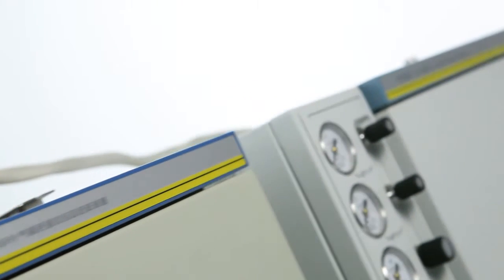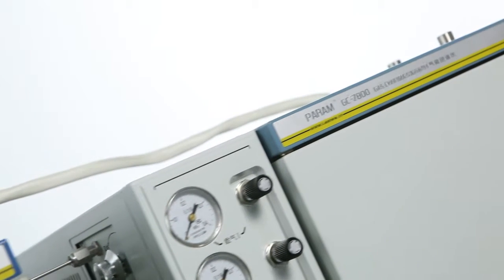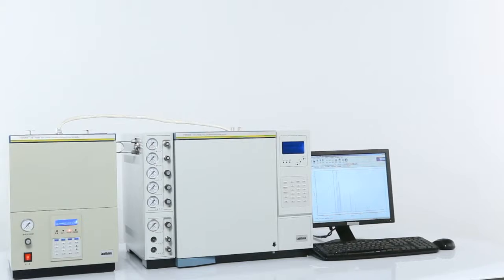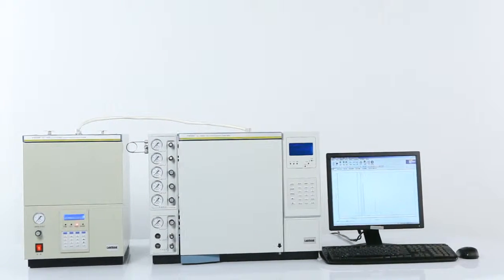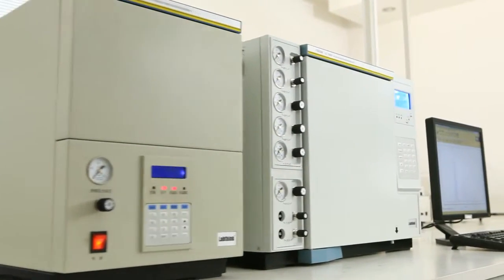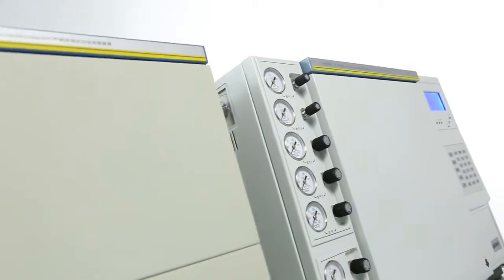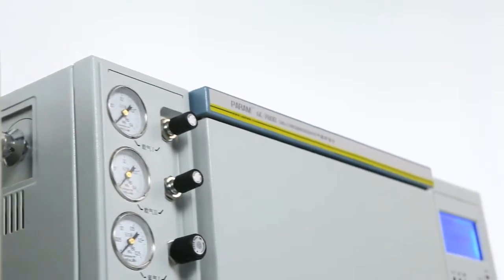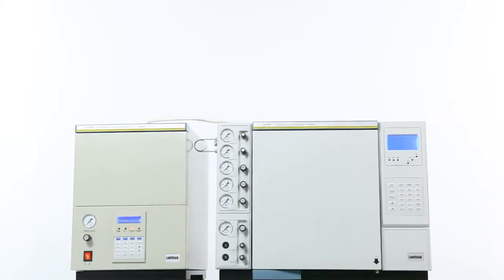The GC7800 Automatic Organic Solvent Residue Analyzing System is widely used in printing and packaging related fields, providing an excellent solution for testing services organizations, research institutions, packaging manufacturers, and food and pharmaceutical industries to conduct high precision residue and purity analysis of organic solvents.